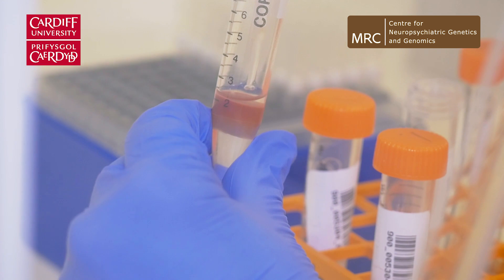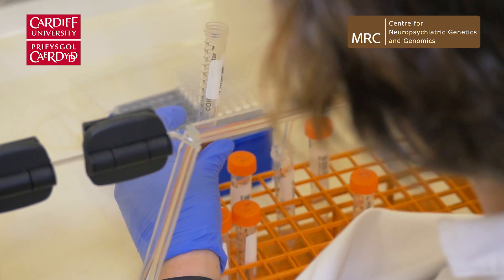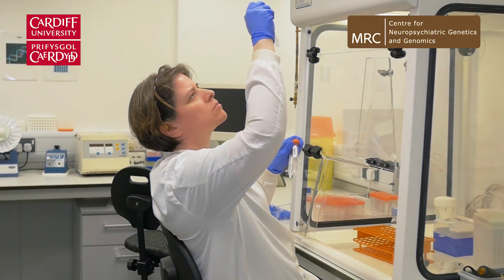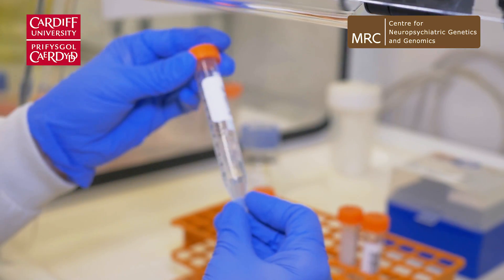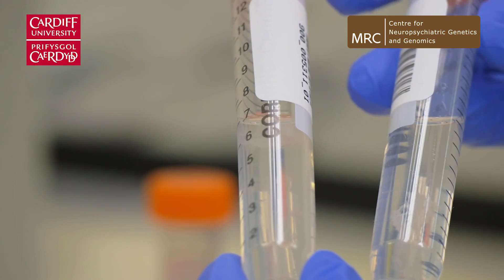We've still got DNA in solution with other contaminants that we don't want, so we need to take that layer into a fresh tube. We add in an excess of ethanol and that turns the solution much more hydrophobic because of the chemical properties of the alcohol. DNA is much less soluble in the alcohol — it literally just drops out of solution. That is where you see the clouds of white fluffy DNA forming.